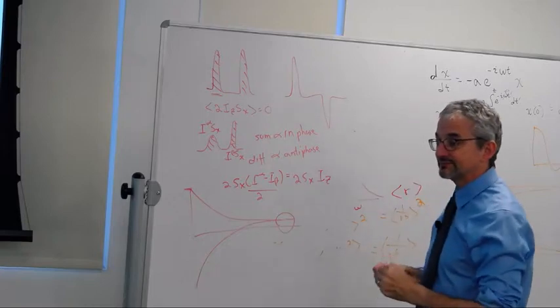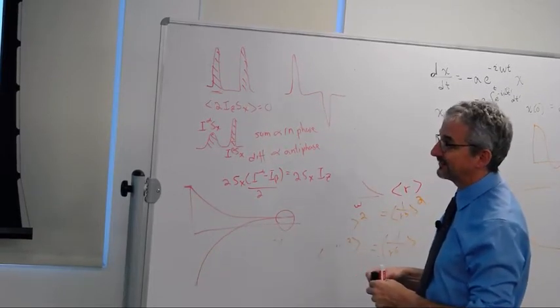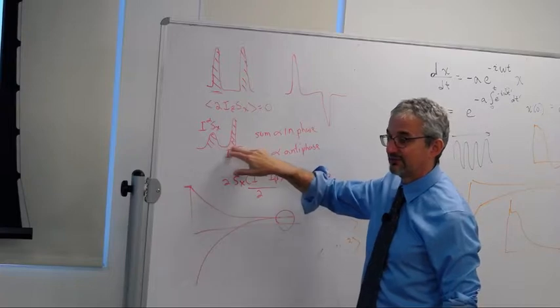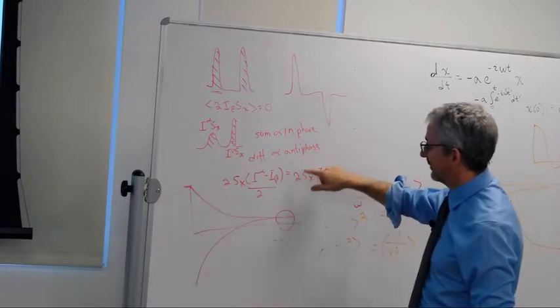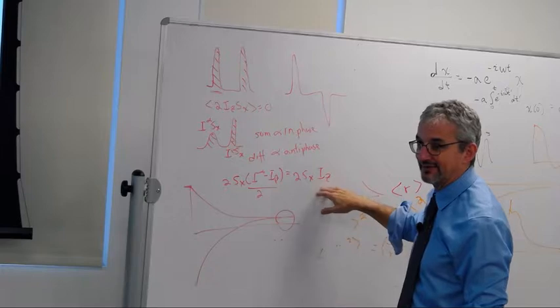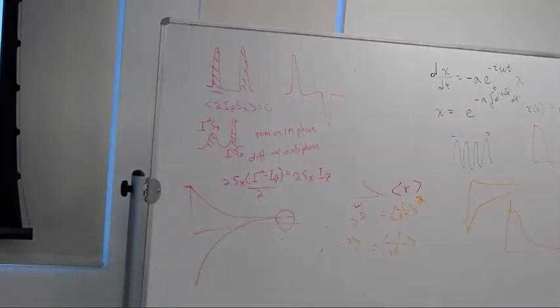So I can then think of the cross-relaxation effect, or the relaxation interference effect, as differential decay of the two doublet components, or I can think of it as cross relaxation between the in-phase operator and the antiphase operator. They're both equivalent, but most of the time we make the measurement by thinking of cross relaxation.